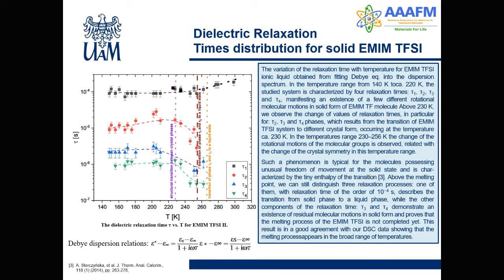We measured complex permittivity versus frequency. So we were able, using the Debye dispersion relation, to estimate the dielectric relaxation time, which describes the molecular motion in the solid of the EMIM molecule. In the solid state of the ionic liquid, we find a few kinds of molecular motion, which are stable in the temperature range up to about 230. Then they change and they vanish above the melting point of the ionic liquid.